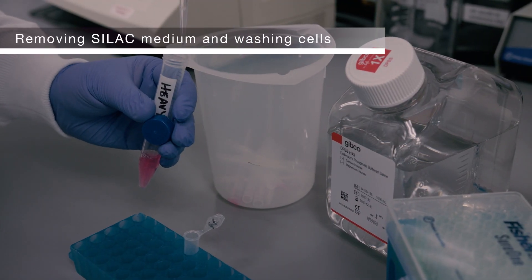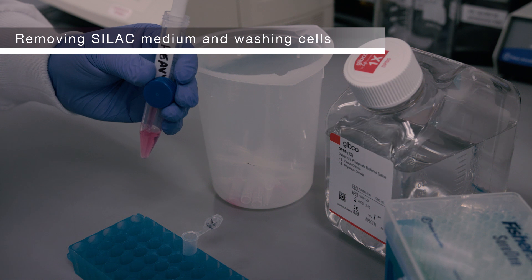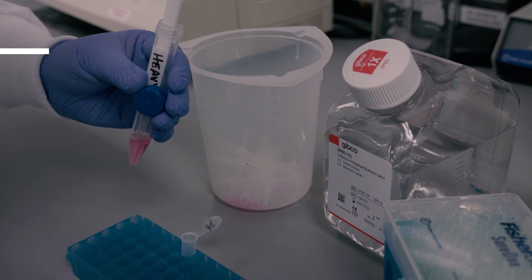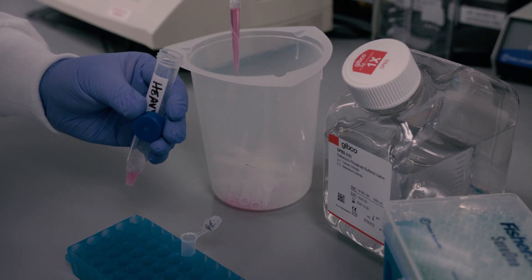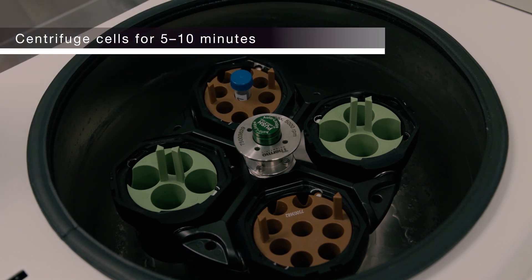Prior to mass spec analysis, the cells should be washed twice using 5 cell pellet volumes of PBS and centrifuge for 5 to 10 minutes at 500 times G to pellet the cells and remove the SILAC medium.